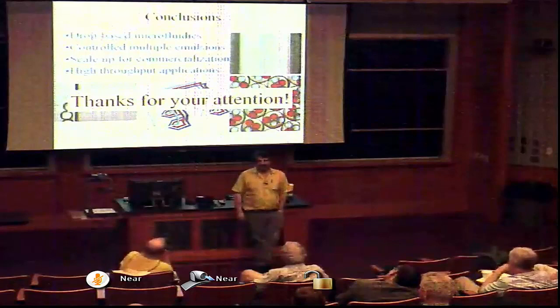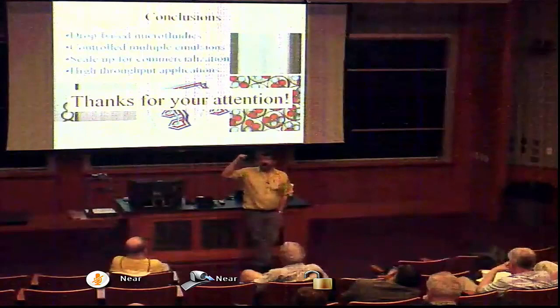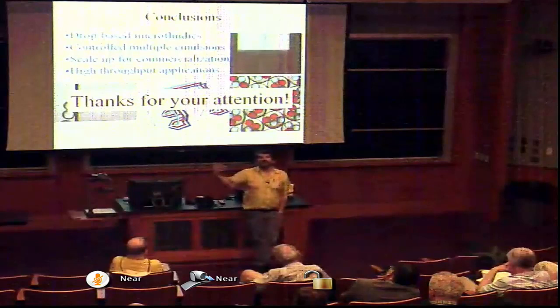Well, okay, so you're asking a lot of questions. Do we use ultrasound? The answer is absolutely. We can make drops that way. We've developed a way of sorting. I showed you with these dielectrophoretic sorters. We developed a way of using a surface acoustic wave to build a sorter. We've developed ways of merging drops with acoustic waves. If you're thinking about delivery and bursting things in the body with ultrasound, we have done things like that.